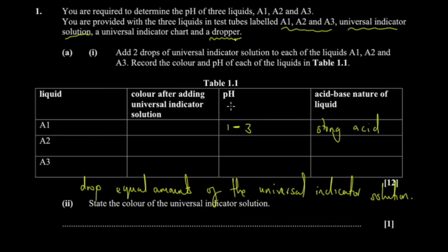There are some generalizations that you can make, so be able to make that maybe in a later video. But essentially, if you were to measure the pH, this would be one of the ways that you do it. There's also the pH paper one. I think we'll cover it in a separate video. Another way to measure the pH, because this time they might not use the universal indicator solution. Maybe they'll use pH paper, and then it would be up to you to actually investigate as well in a different method, but somewhat similar. So you should know at least this one, and then you should know the alternative ways.